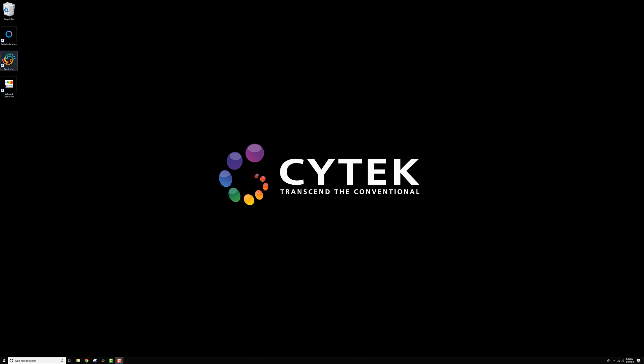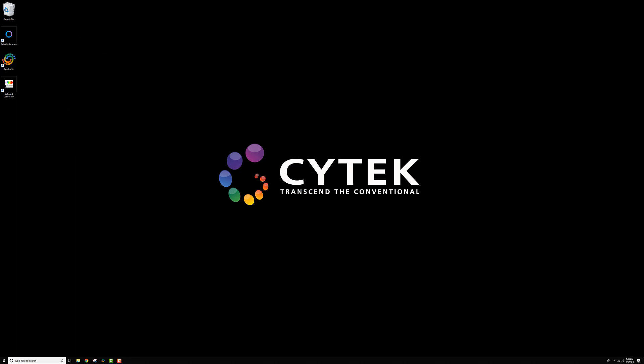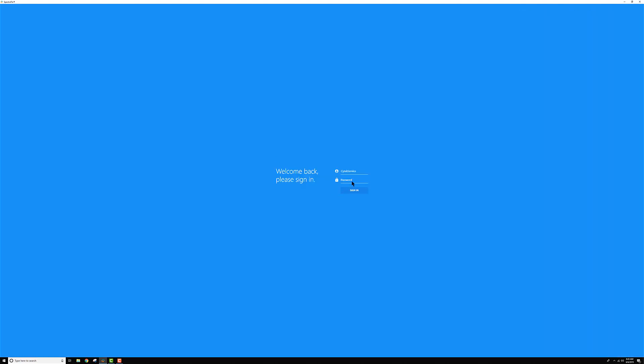So first, if I go and open the software by double-clicking the SpectraFlow icon, we'll wait for it to load up here. Once it opens, you can go ahead and log in.